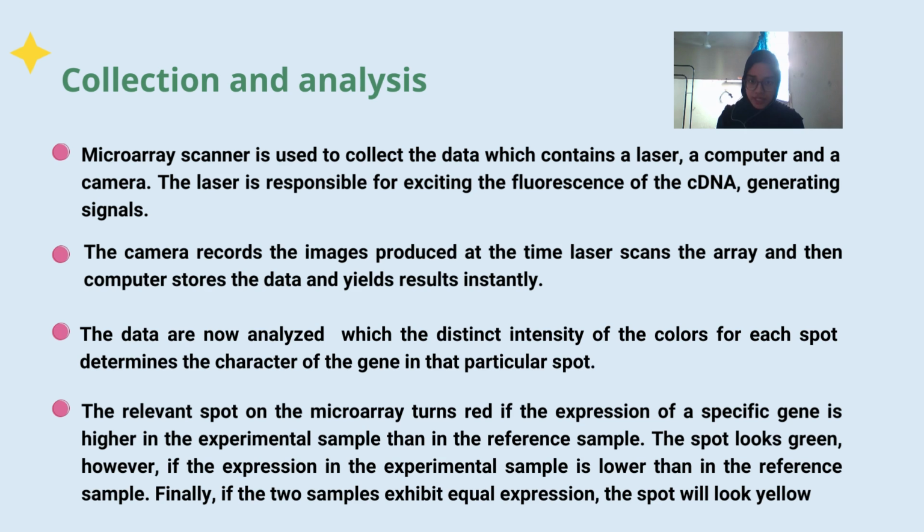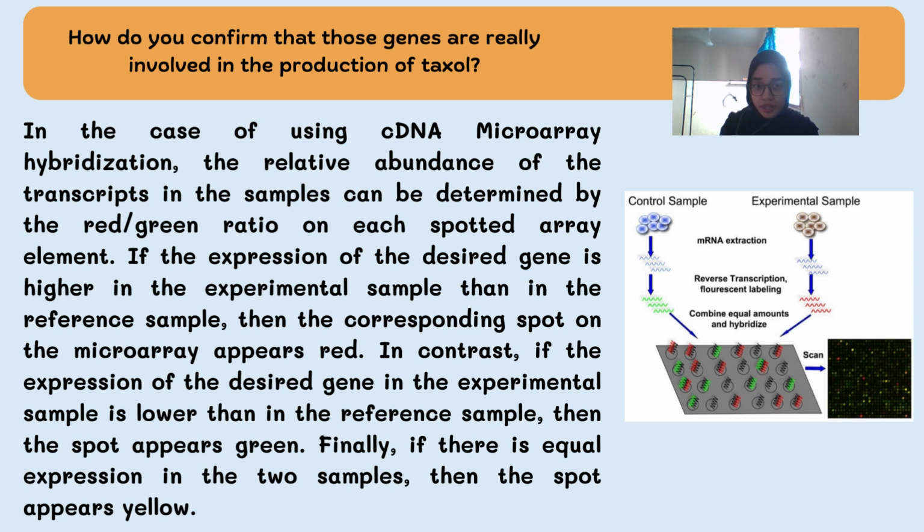Dual-channel laser excitation excites the corresponding dyes. The spots may appear as green, red, and black, or sometimes yellow, depending on the expression level. So what should we do next? Do we need to do calculation? Do we need to put it under special microscopes? So how to confirm our result? Well, it is actually simple.